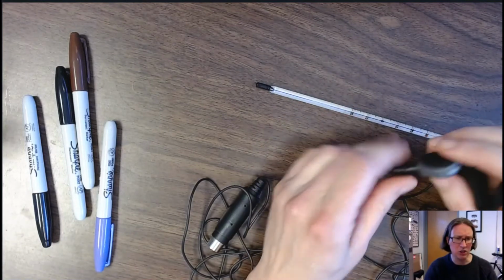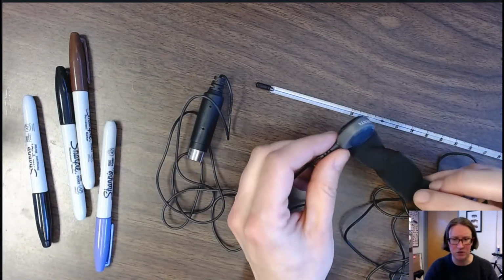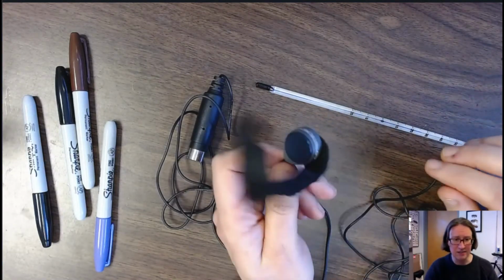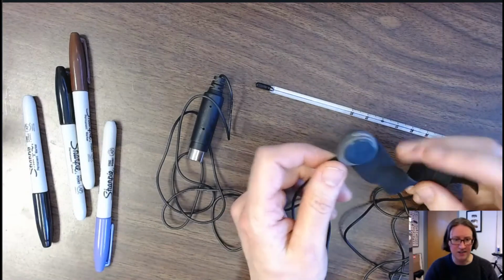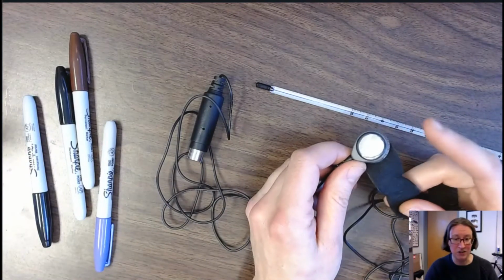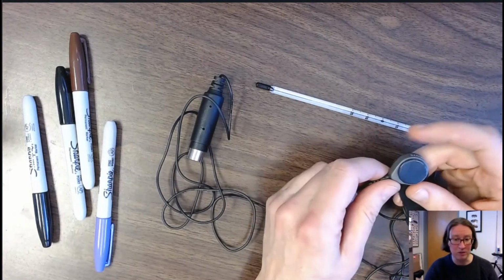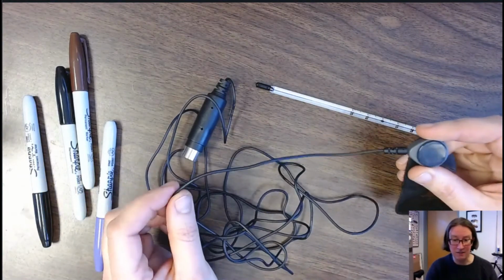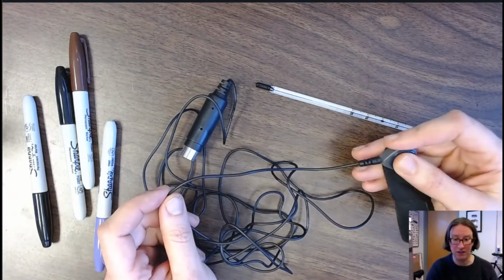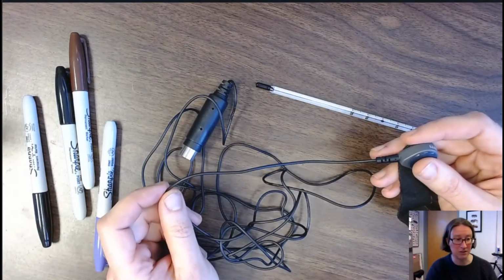There's something else that we should notice about the name of this device as well. So it's called a pulse transducer. So what that word transduce means is that this is a device that's designed to take some kind of signal or some information input, and then it's going to convert it or transduce it to some other form. And more specifically, in this case, the finger pulse transducer is going to take the pressure signal from my finger, and it's going to convert that pressure signal into an electrical signal.